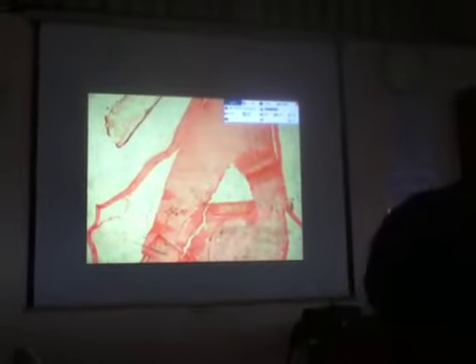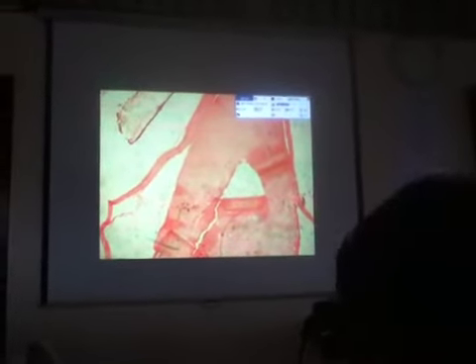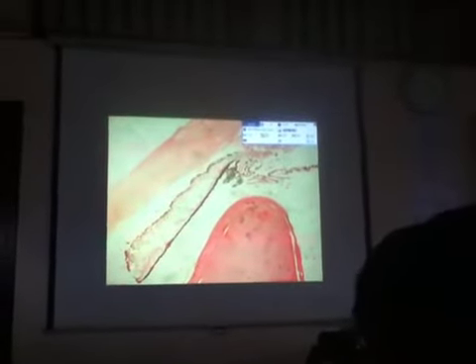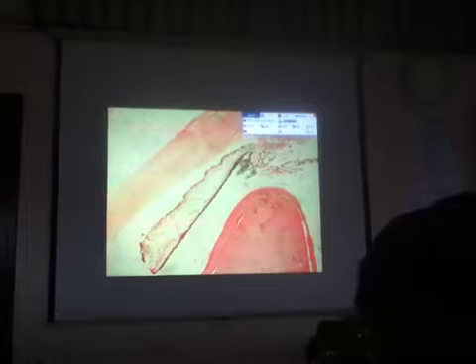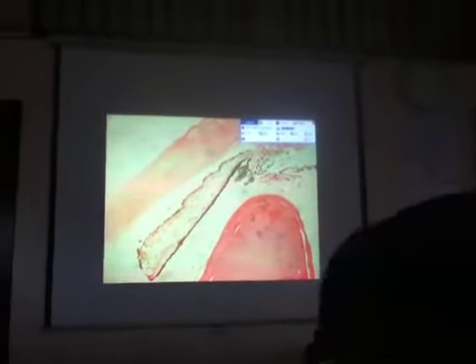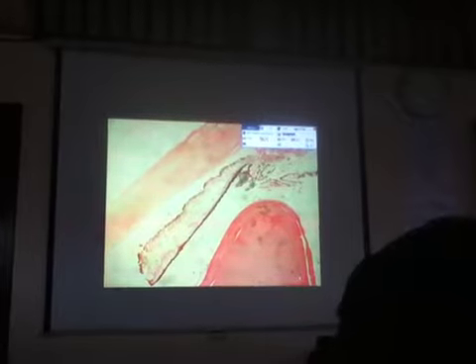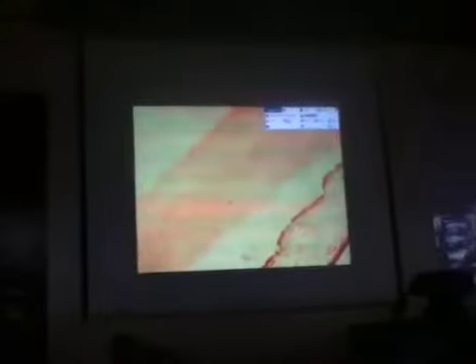Which is also involved in accommodation of light. Okay, the lens. Now, if you have already located the lens, anterior to the lens is the anterior covering of the eye, which is called the cornea. Very good. The tissues of the cornea are grouped into 5 layers. So, okay, that is the cornea.